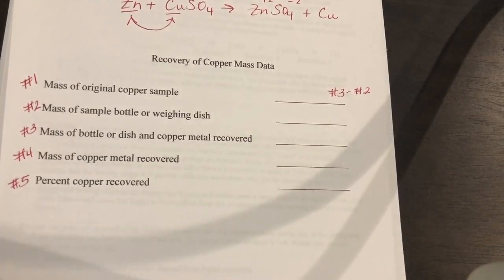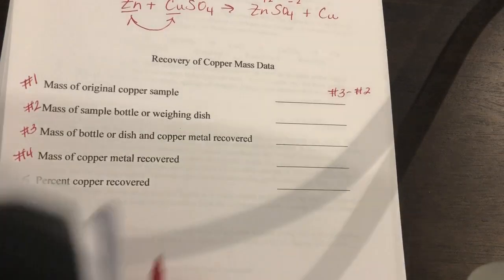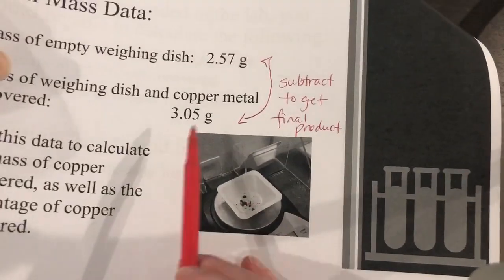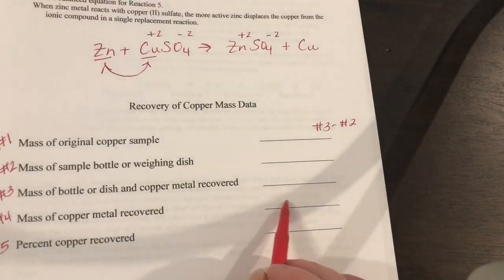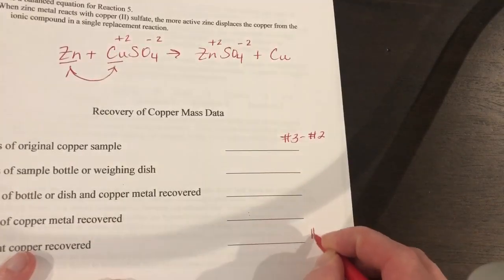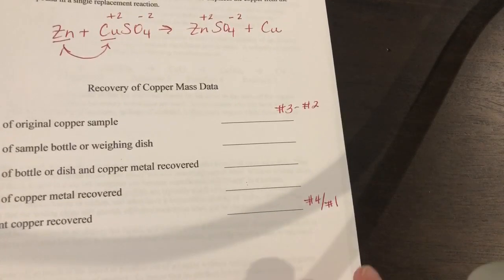And then for 4 and 5, you get 4 and 5 from the back of the lab. So to get number 4, you're going to subtract 3.05 minus 2.57. So that's how you get number 4. And the percent of the copper recovered is going to be number 4 over number 1. So you should get a number close to 90-something percent.